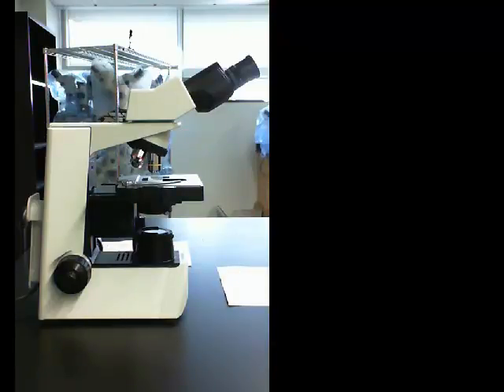We want to be careful about the location of the slide relative to the objective to make sure that we don't accidentally scratch an objective with the slide. Therefore, we're going to use the coarse adjustment knob with the scanning and lower power lenses, and only use the fine adjustment knob with high power and oil immersion lenses. We should not be using the coarse adjustment knob with high power or oil immersion.